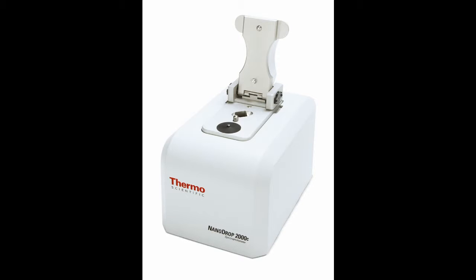The Nanodrop 2000C is an ultraviolet visible spectrophotometric machine that allows for accurate measurements of nucleic acid concentration by using only a minimal amount of sample. This machine operates by changing the path length between 1 mm and 0.2 mm to measure a wide range of DNA concentrations between 2 ng per microliter to 3,700 ng per microliter.